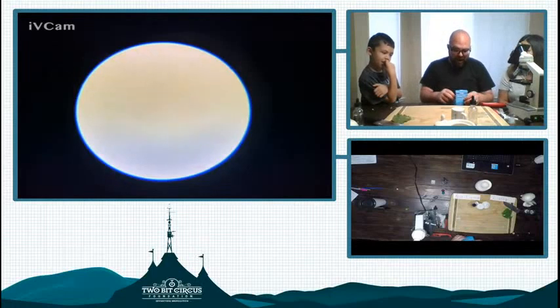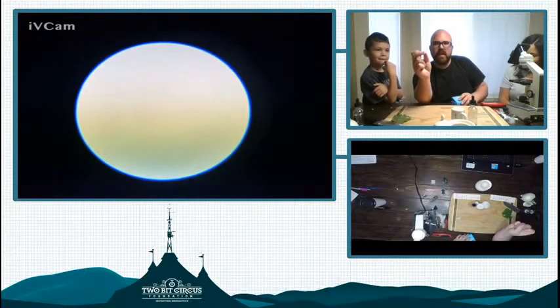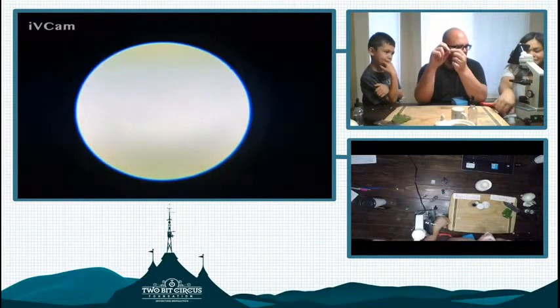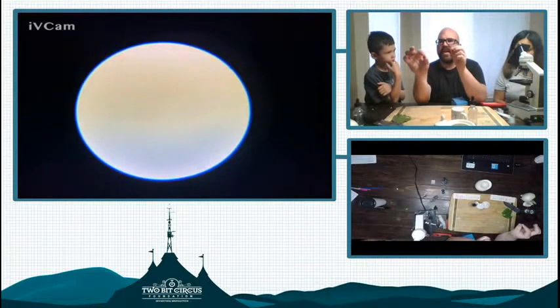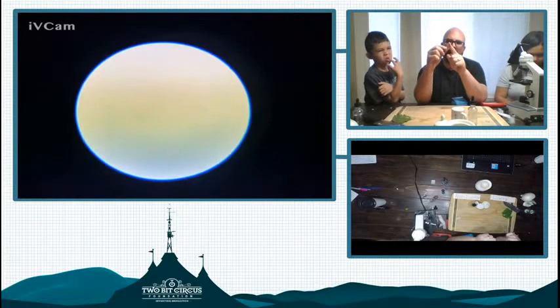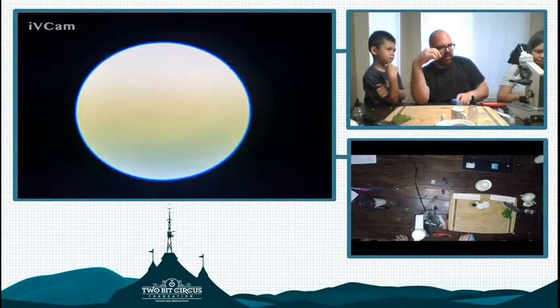Stereo microscope, so big one. Compound microscope. Awesome. So what we're going to do is an experiment. We could test Robert's hair too, but I think this one is cool. We're going to take a clean toothpick. These actually are nice toothpicks. They don't actually have points on them. Are these special biologist toothpicks to do this experiment? Yes, those are the ones I use. So these are safe toothpicks to do this with. They're flat tipped. You could do it with a pointed tip toothpick as well, just be careful that you don't stab yourself with them.